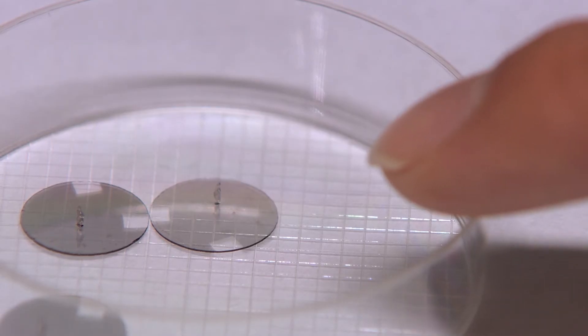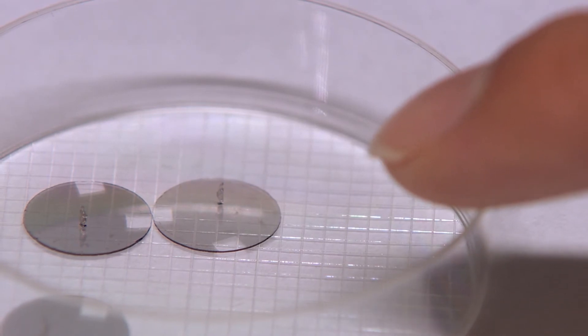We just put the liquid materials there. Black portions of the image are washed away while the white becomes a 3D printed object. That's how we build this structure layer by layer.